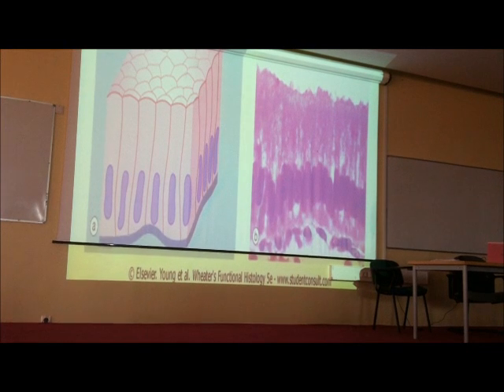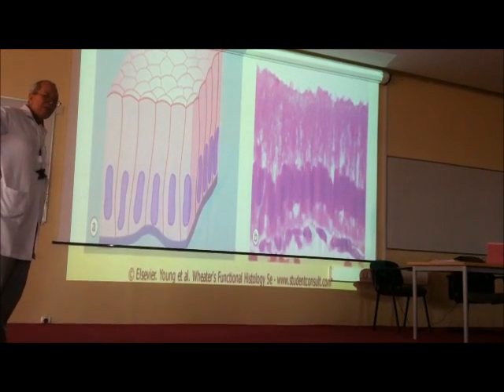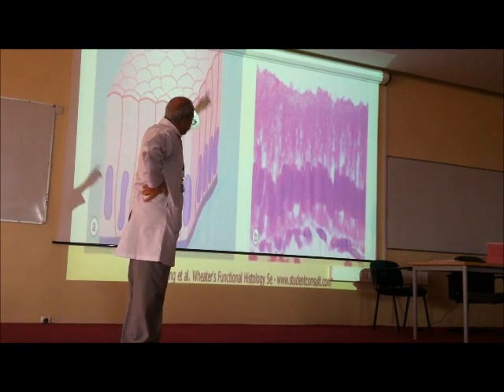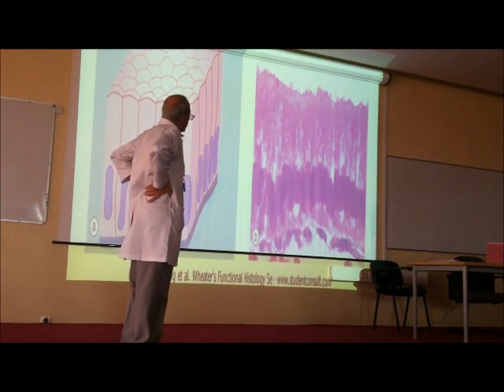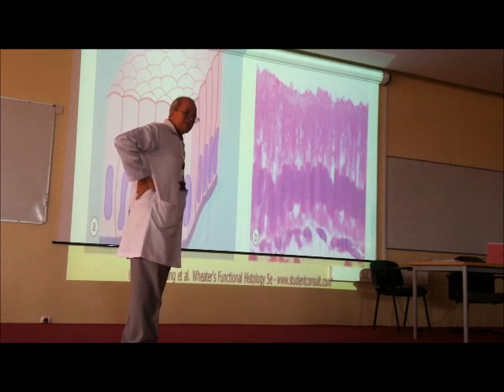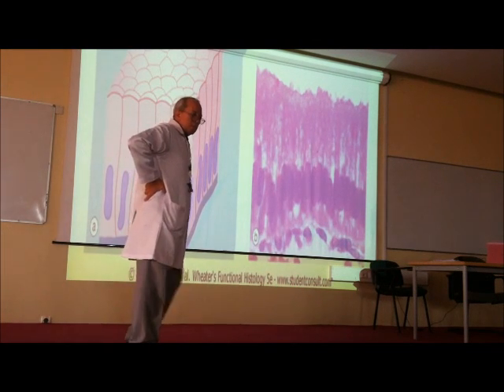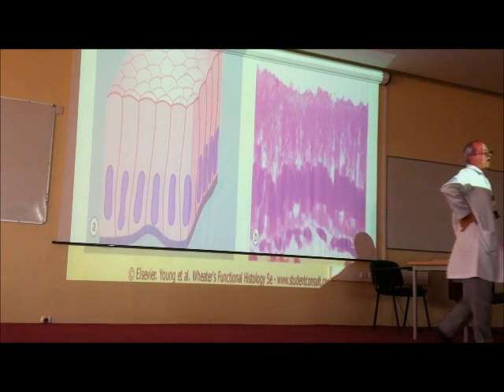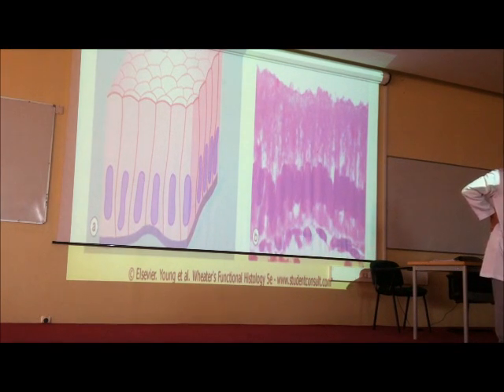Okay, what is the type of this epithelium? Simple columnar epithelium. Why? Oval shape, the height is taller than the breadth. What's the shape of nuclei? Oval shape. Where can you find it? Small intestine. Do the columnar cells have more than one function? Yes. Where can you find the secretory type of this epithelium? Stomach. Okay?